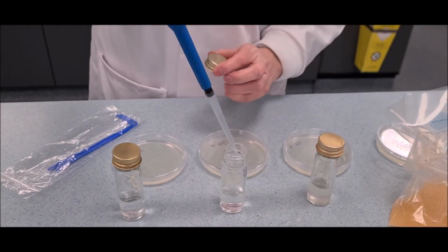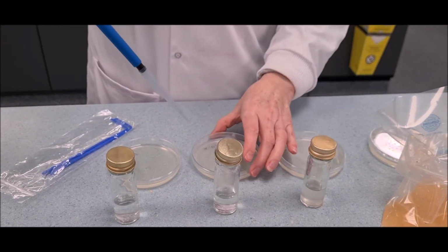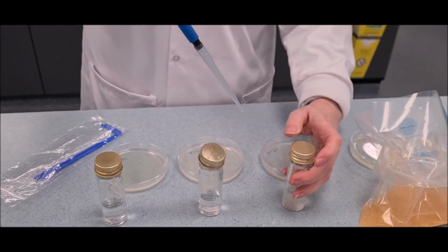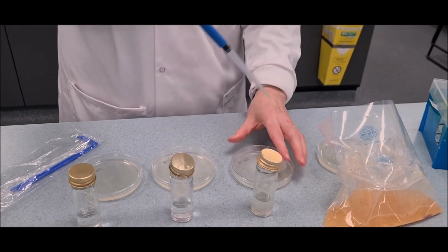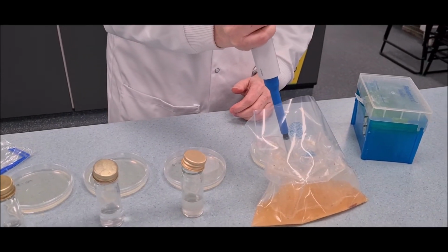Using the serial dilution method allows for the enumeration or counting of the colonies and therefore estimating the number of bacteria in the food sample. Only colonies showing the characteristic growth are counted.